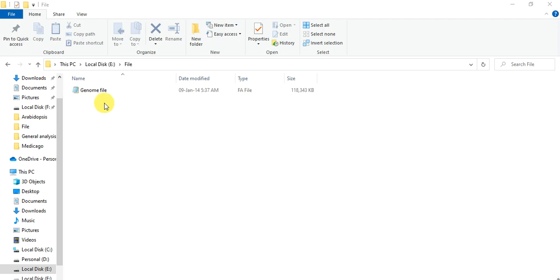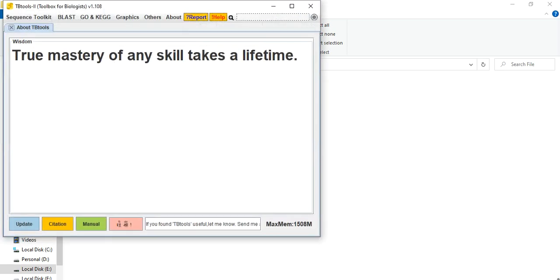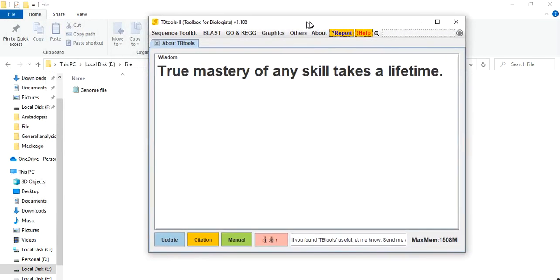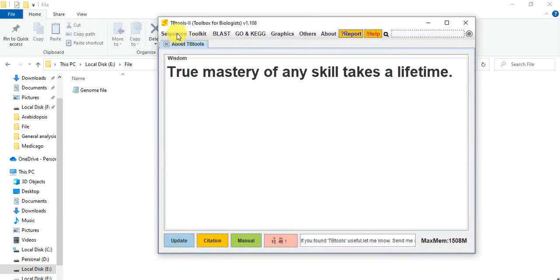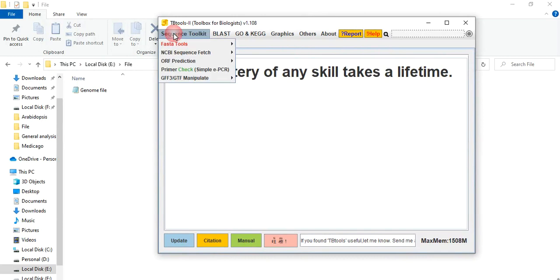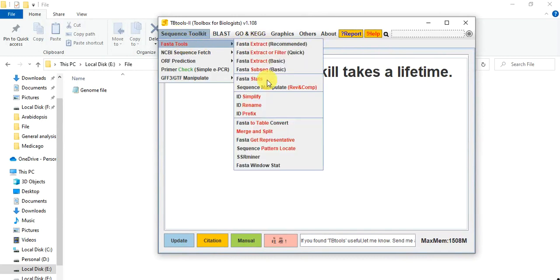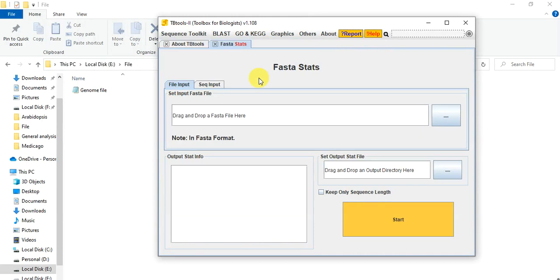After downloading that genome sequence file from NCBI or Phytozome or any other database, then you need to open the TB tool, go to sequence toolkit, FASTA tool, and then FASTA Stats.